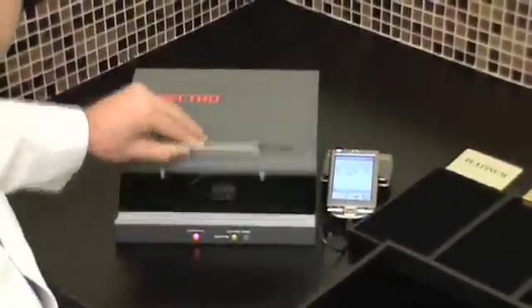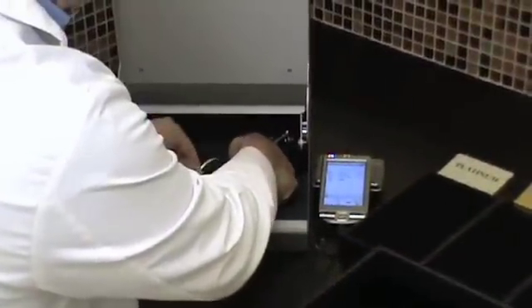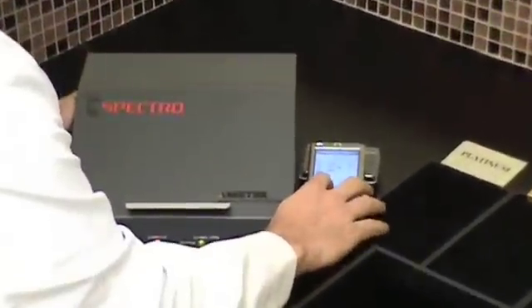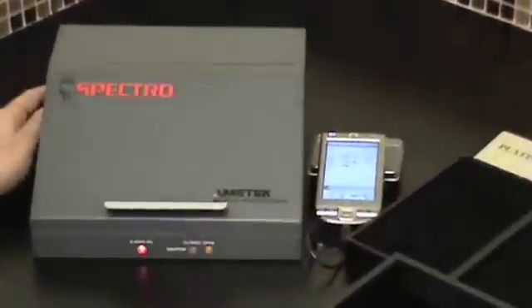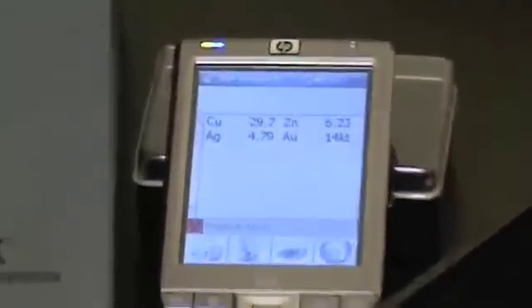So I'm going to place a bangle in here now and within 10 seconds we're going to get the complete breakdown of this item.